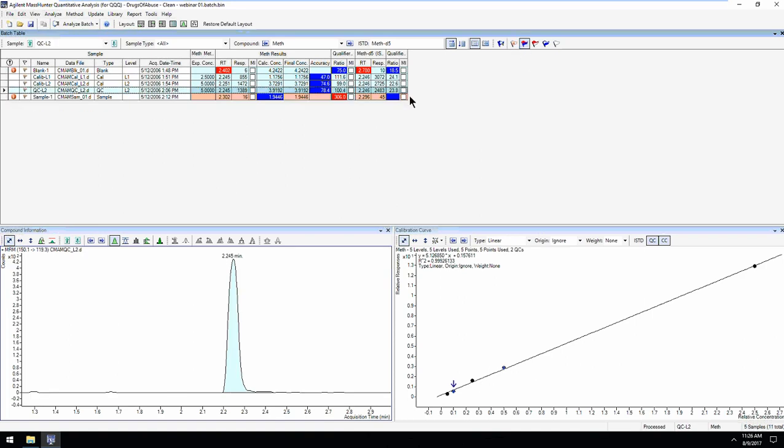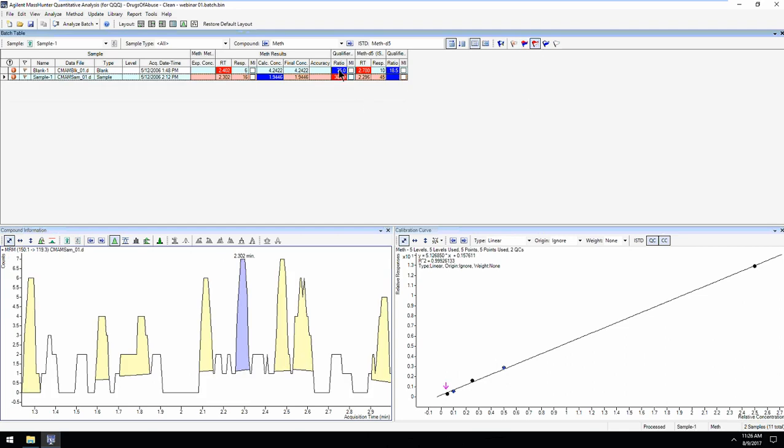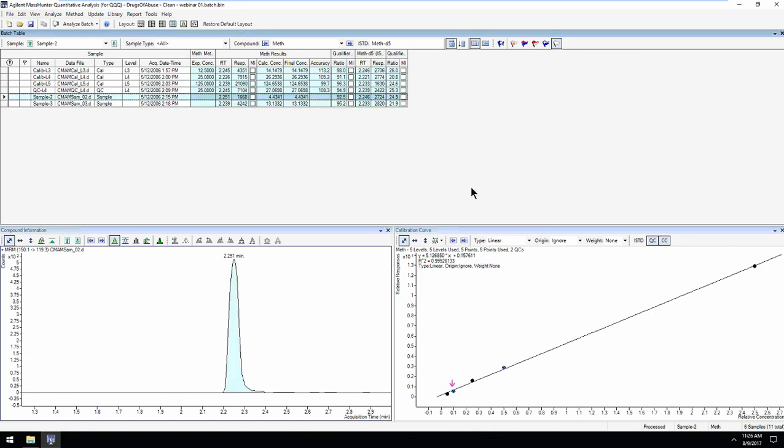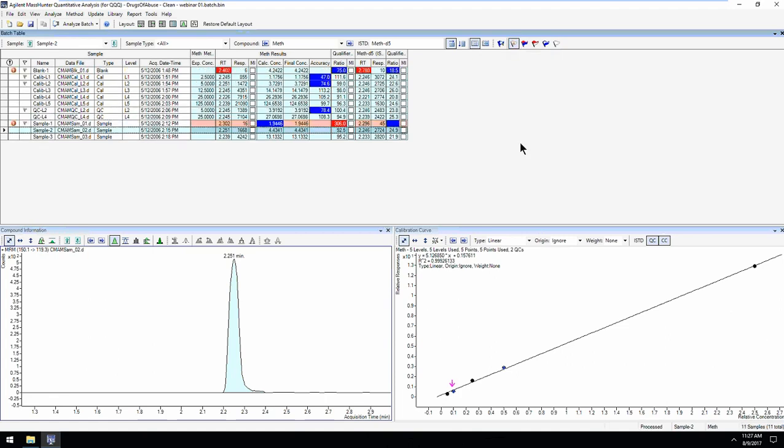The filters here are nice. Again, we can look to see things with any outliers, high or low, only the high ones, which also have some low results as well, same if we go just with the low. Or, since we're looking at a sample run-based view, we can see all the runs that do not have any outliers, and we can go back to seeing all samples there.